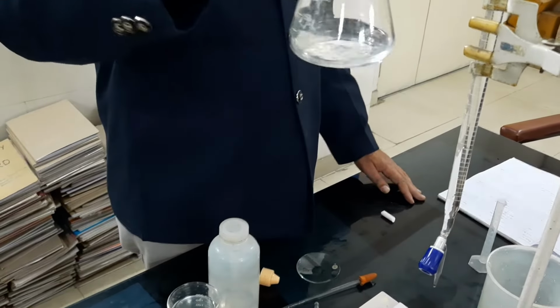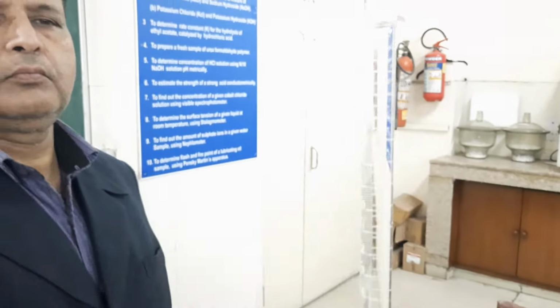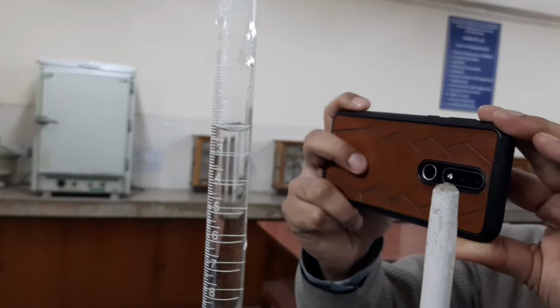Now the color has disappeared. Note down the volume of N/10 HCl consumed from the burette and repeat the same procedure to obtain a concordant reading.